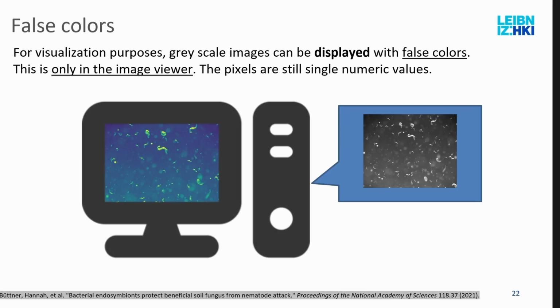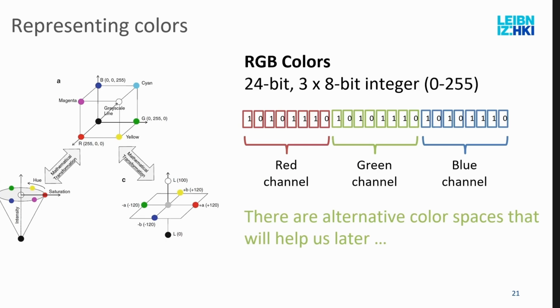So, regarding colors, I have some questions. Yes. Generally when I took some images, I went with either 12-bit or 16-bit, and what does it mean? They were taken with 3 channels as well, so blue, green, red. So there is a different allocation, 12, it's an integer, but a different one.